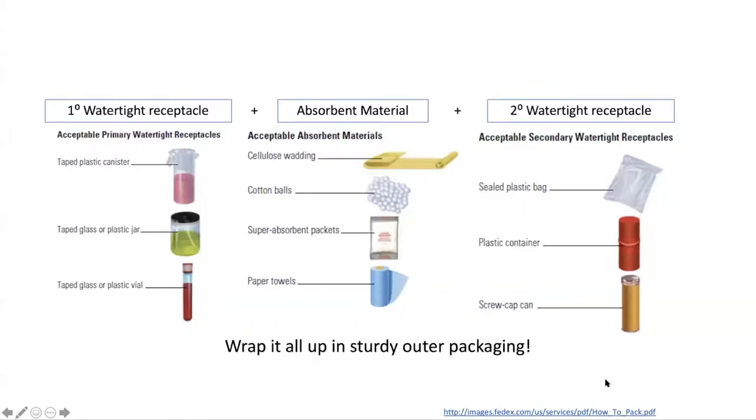There are a few key principles to keep in mind when packaging your samples. First is to make sure that the sample is contained within a primary watertight receptacle. This is most often accomplished by the sampling device itself. Next is to surround the primary receptacle with a sufficient quantity of absorbent material that if that primary container breaks, all of the liquid can be readily absorbed.